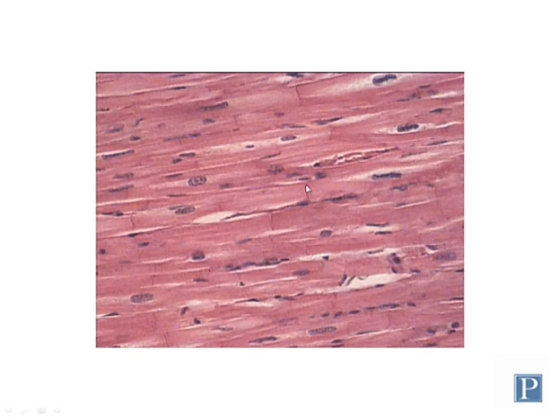You can also see these dark staining structures at the junction between the ends of adjacent cardiomyocytes. These structures are called intercalated disks. Okay, so here's one cell, here's another cell, here's where the two ends meet, and here's an intercalated disk in the middle of those.